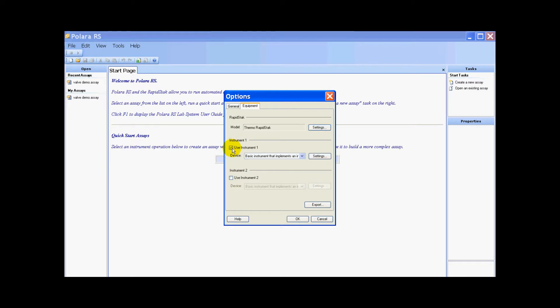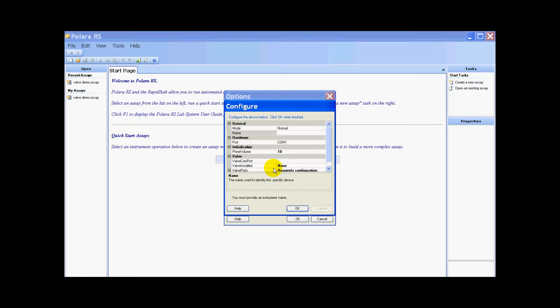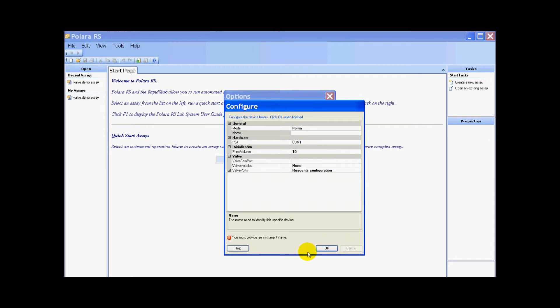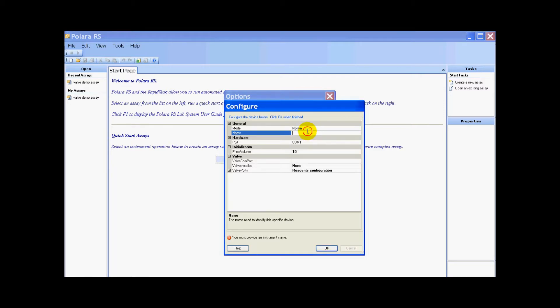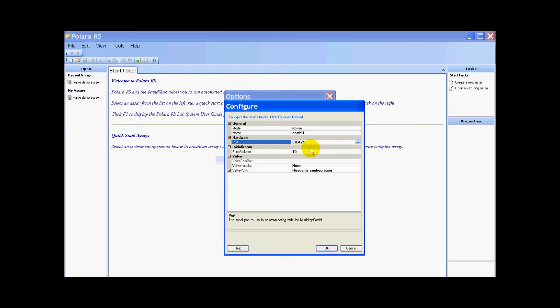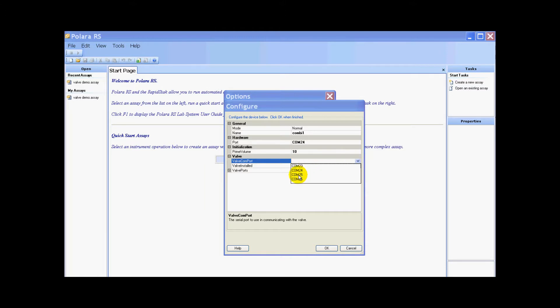Next we have to add an instrument, which is going to be our multi-drop combi. I select the multi-drop combi and a settings dialog pops up. We do have to configure everything for the multi-drop combi. Our mode has to be normal. I'll give the instrument a name, calling it combi one. We have to give the COM port where the multi-drop combi is connected. I am on COM port number 24. The valve itself has a serial port as well, and it is on COM port 25 on my computer.